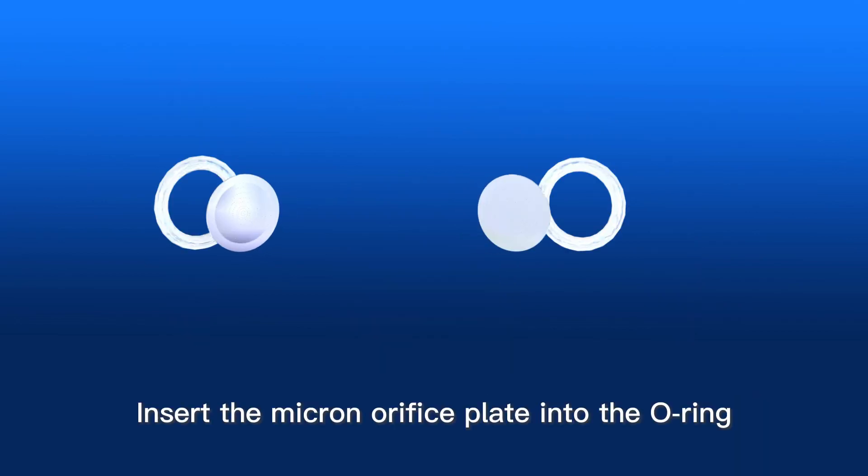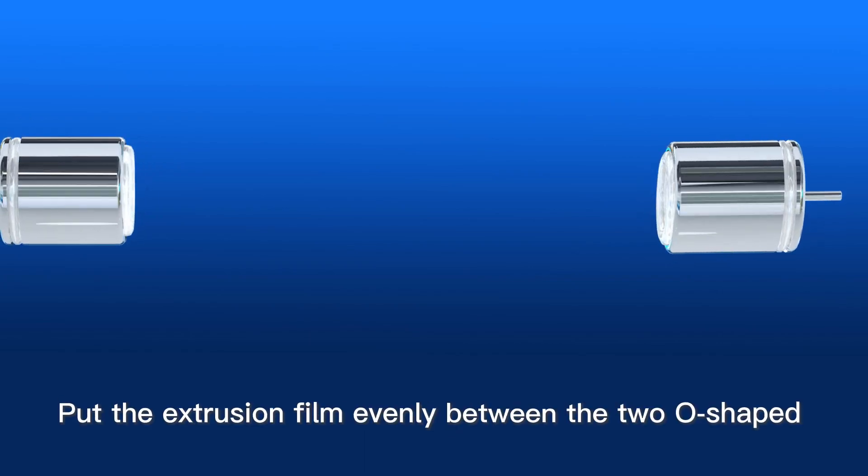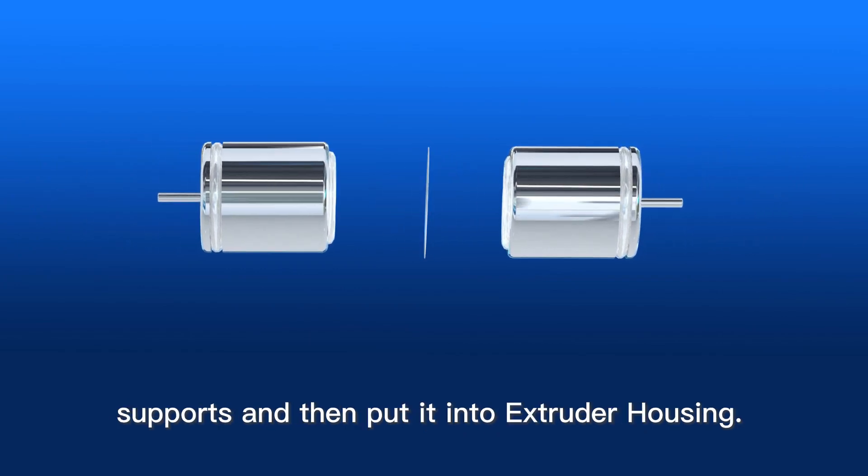Insert the micron orifice plate into the O-ring. Place the dark side upward into the groove of the O-ring bracket. Put the extrusion film evenly between the two O-shaped supports and then put it into extruder housing.